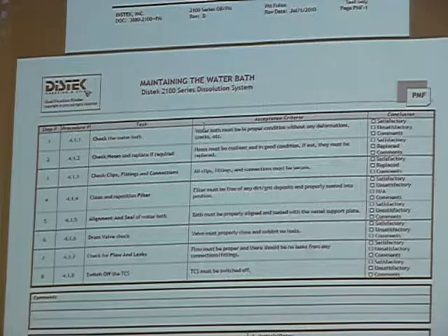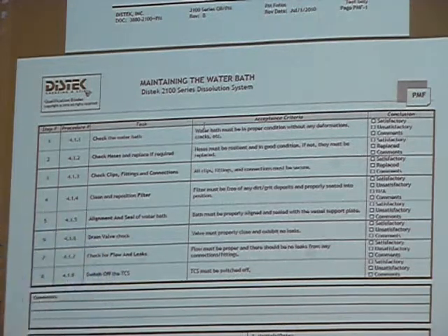Checking the water bath. Just inspecting the bath to make sure it's fine, there's no cracks. When they say checking the water bath, they're talking about the acrylic bath itself. You want to make sure that it's not cracked, not falling apart, not warping too much. It needs to be staying in a rectangular form.